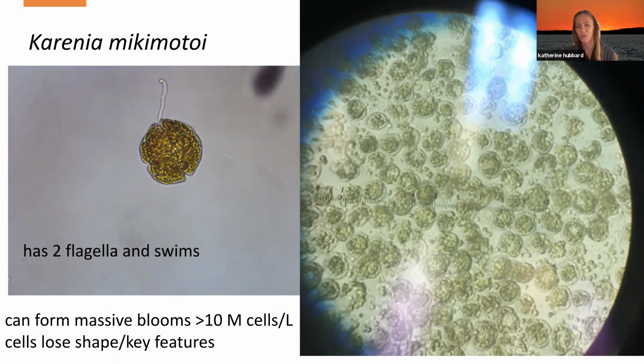And so then you look to some other things like the color of the water. And for this one, we actually did have to do genetic ID to confirm that. But it does give you a sense. And it's great to take these sorts of shots with your phone if you can, because you never know, that might be something that you can pass on and keep. But in a dense bloom, again, these can be really hard to identify. Next slide, please.